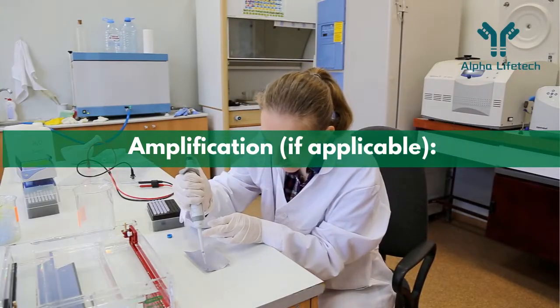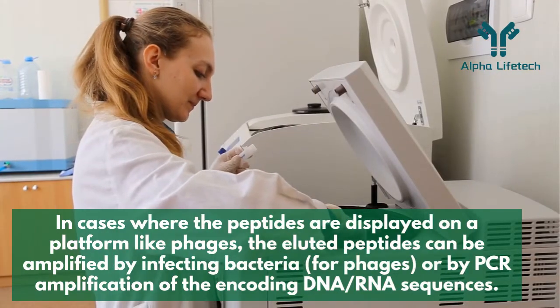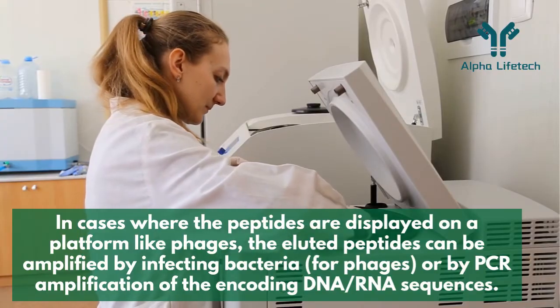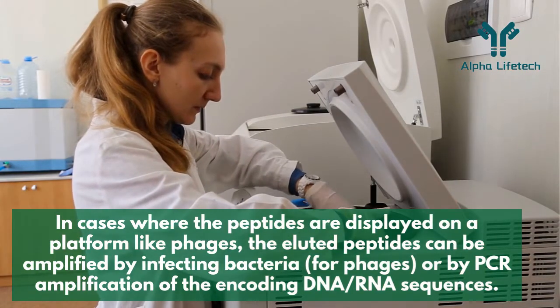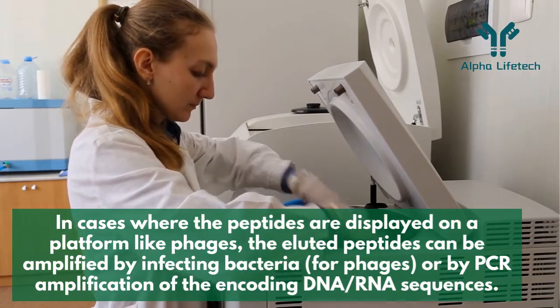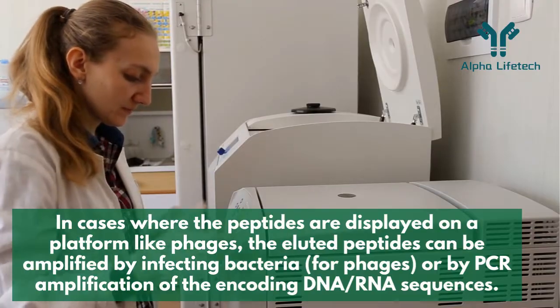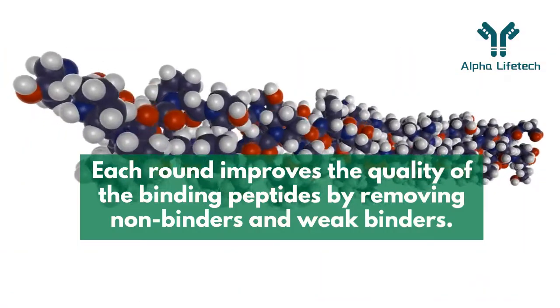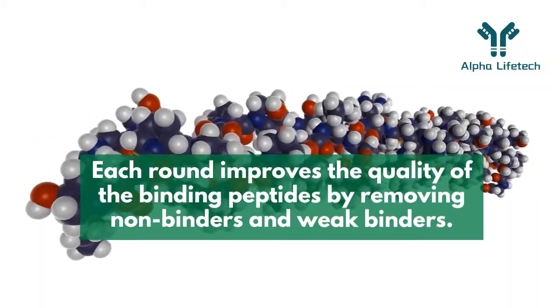Amplification, if applicable. In cases where the peptides are displayed on a platform like phages, the eluted peptides can be amplified by infecting bacteria, for phages, or by PCR amplification of the encoding DNA/RNA sequences. Each round improves the quality of the binding peptides by removing non-binders and weak binders.